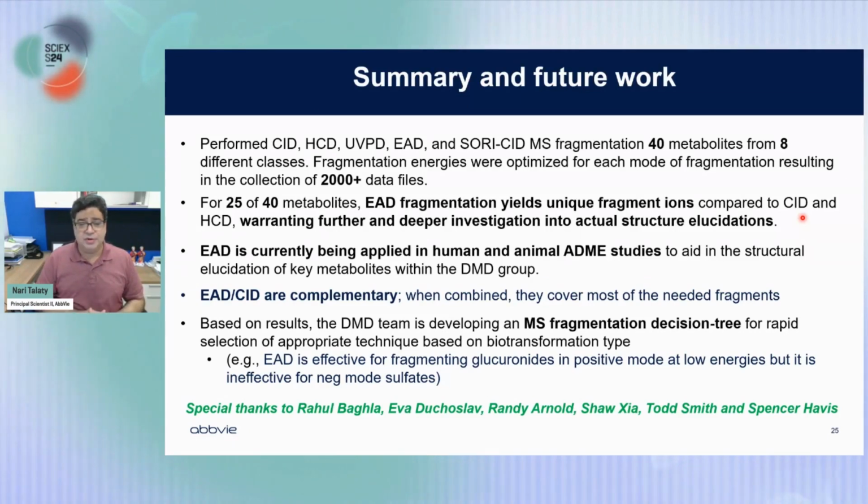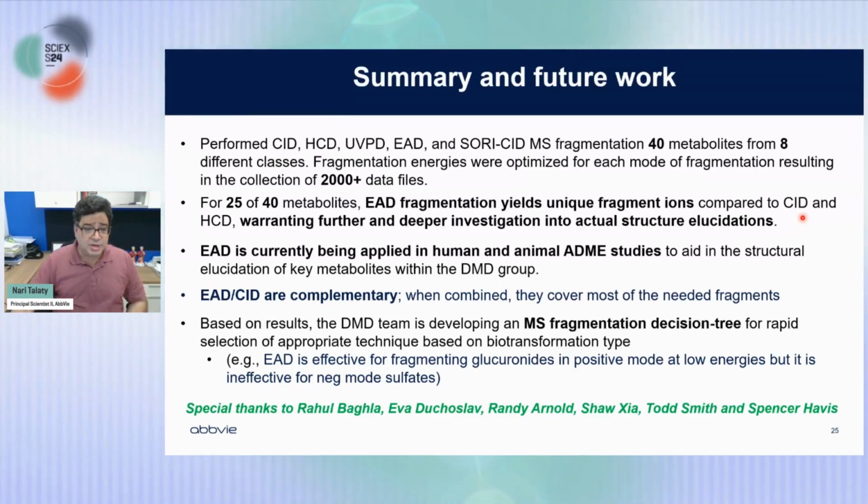And I think you've seen this from some previous presentations as well, that is the power: you're able to do these two things simultaneously. We are really going deeper by using different software, including our home-built software, which one of our co-authors here, Rich, has developed, that goes deep into doing MetID. We're trying to see if that can couple with some of the other tools we have. We can feed into the SciEx profiler software and see if we can get some readouts. So that's another thing we're working on with Ava from SciEx. Rahul and Ava are really helping us with some of these things.